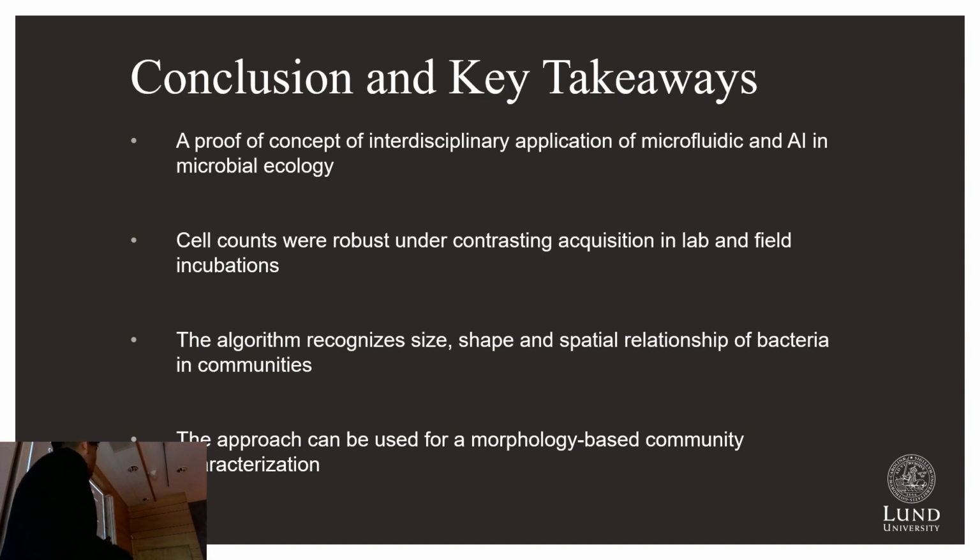The community is mostly characterized via molecular analysis, and there's a lack of understanding of how it correlates with cell morphology and size. That's the direction we are moving to, because with the soil chips, it's transparent. We could look at them live and see the interaction.